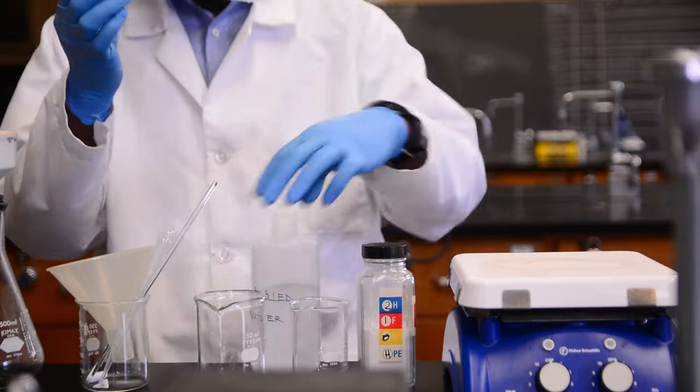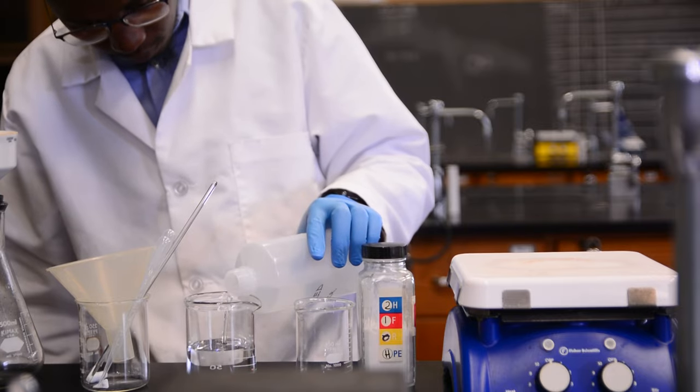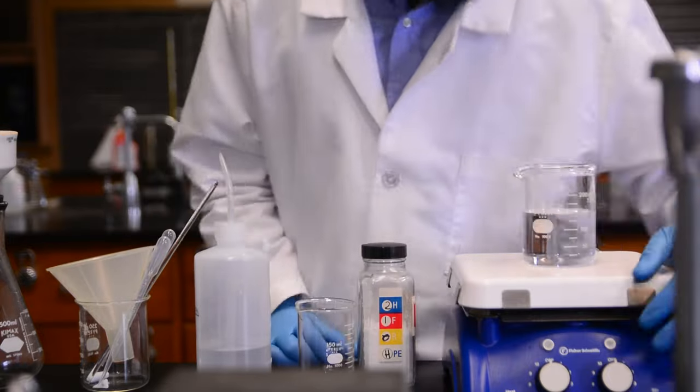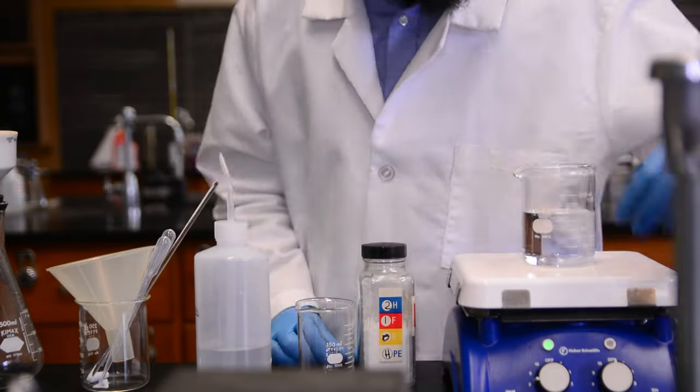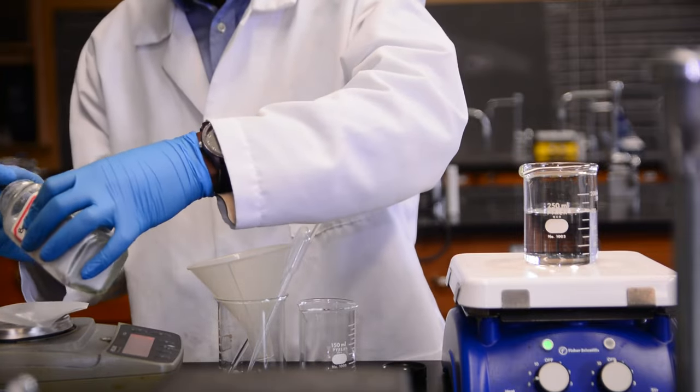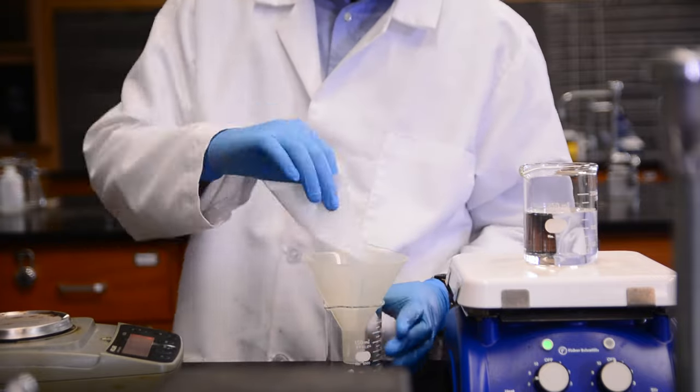We are ready to begin the recrystallization. We will start by heating up 150 milliliters of pure distilled water in a 250 milliliter beaker on a hot plate. As that heats up, let's weigh our impure product. We're going to be using 3 grams of benzoic acid today. Let's add the powder to a clean, dry 150 milliliter beaker.